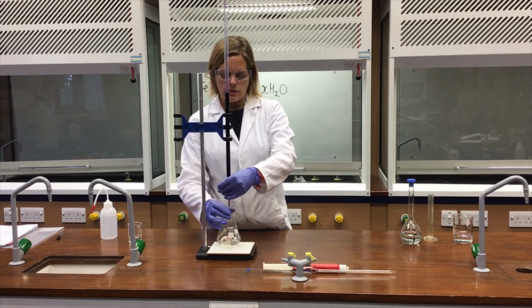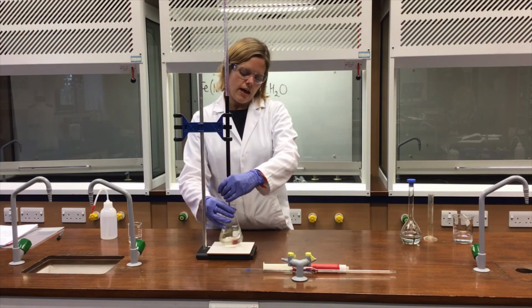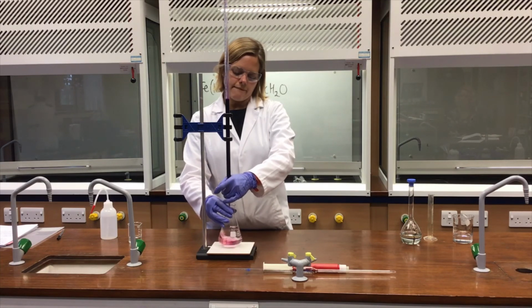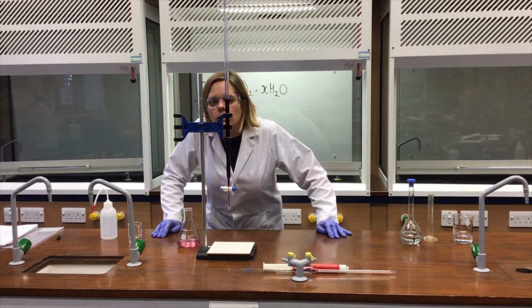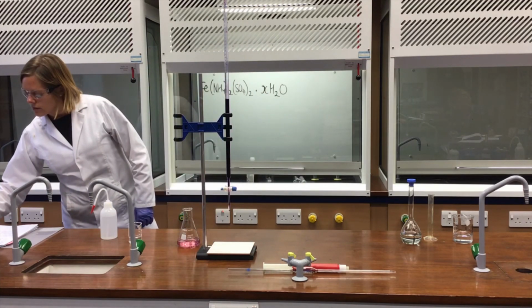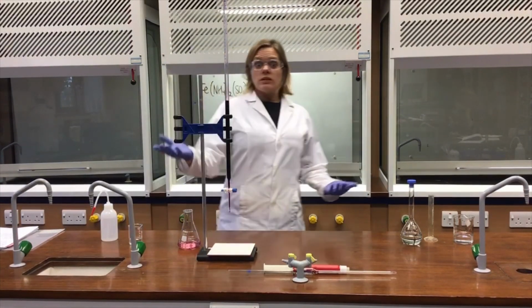But then continue to add that solution nice and carefully. Swirl it away, like in every titration you've ever done before, until that first permanent pink colour. Like that. And off it goes. And so the final value on this first rough titration, 27.00 centimetres cubed. And then you do the same as you would in any other titration.